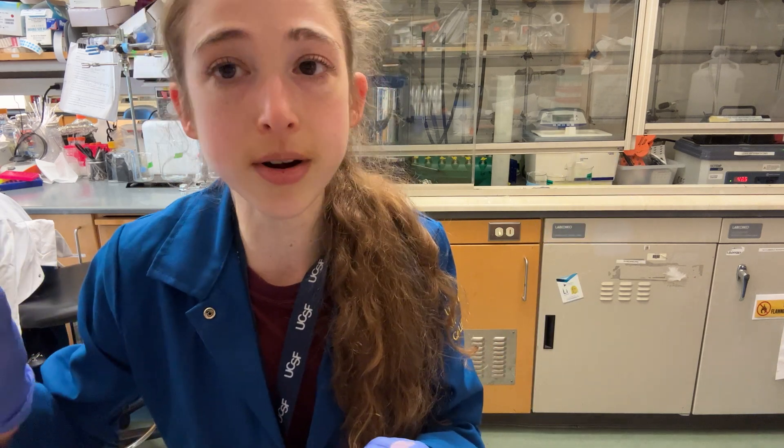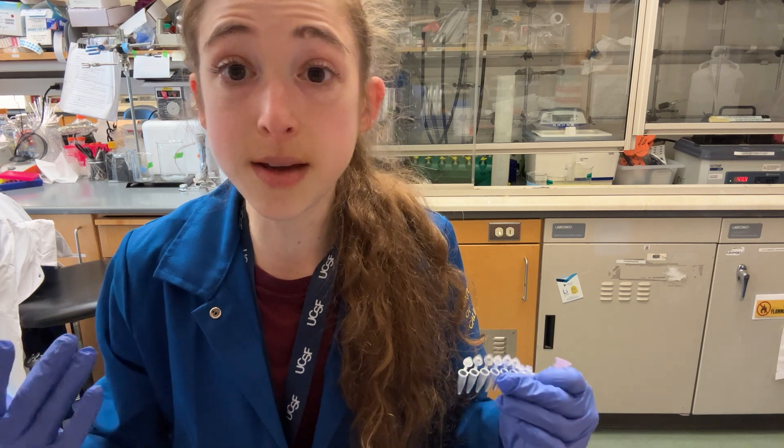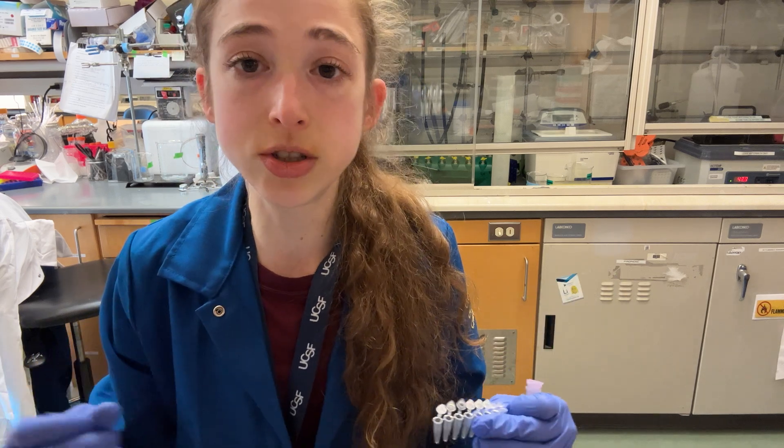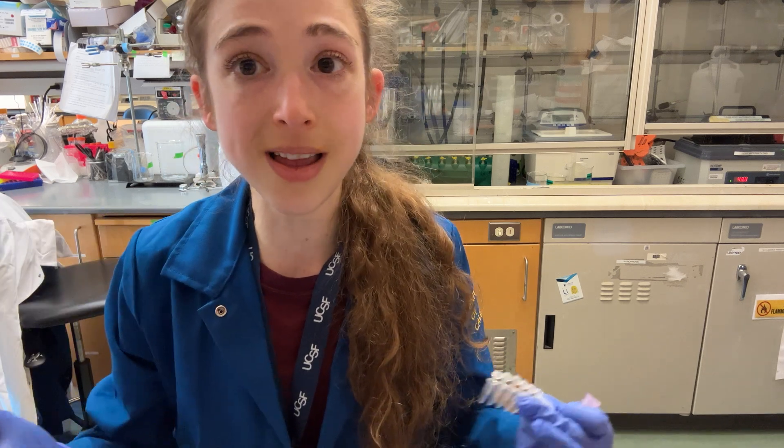I'm going to go set up some PCR reactions — I'm going to make 200 microliters worth of each of my reactions, then just split it up into four tubes, and hopefully get lots of PCR product.